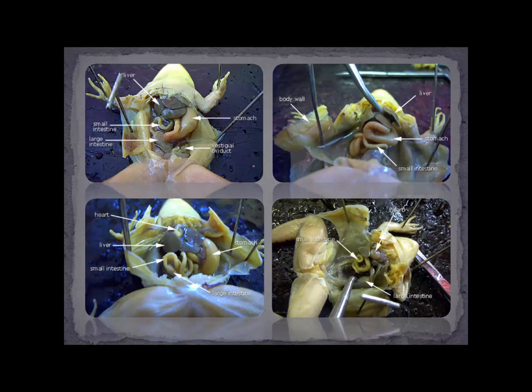We've got a number of images to go through here. This is just with the skin and the muscle pinned back showing the major organs. Again, we've got the liver with its multiple lobes, we've got the J-shaped stomach coming down here — this may be filled with bugs or whatever the frog ate for its last meal, so you can have a look at that. Continuing on, the small intestine curves around here, and here you can actually see the large intestine separating out, coming down and then out.